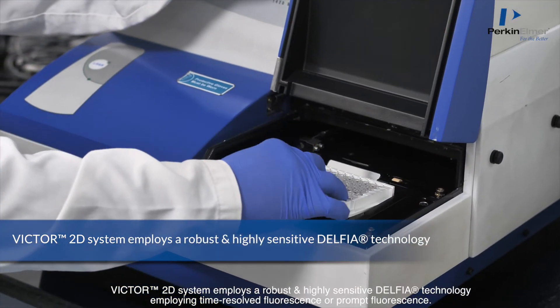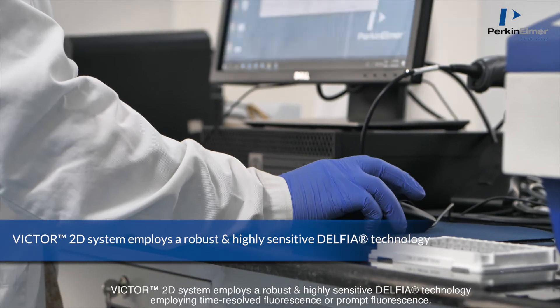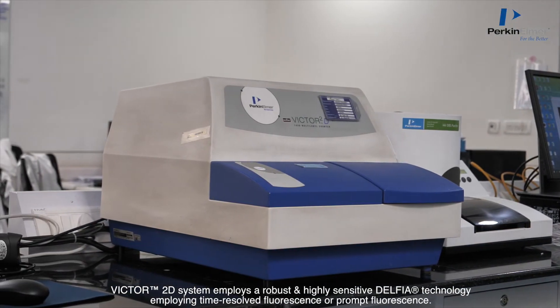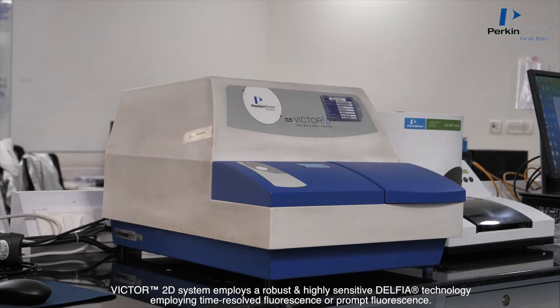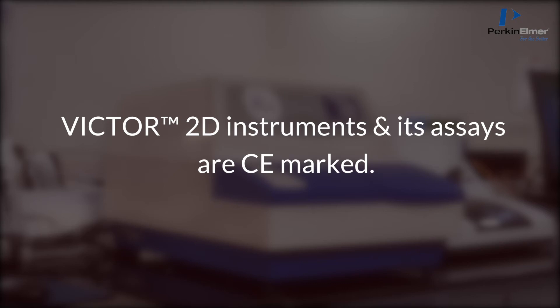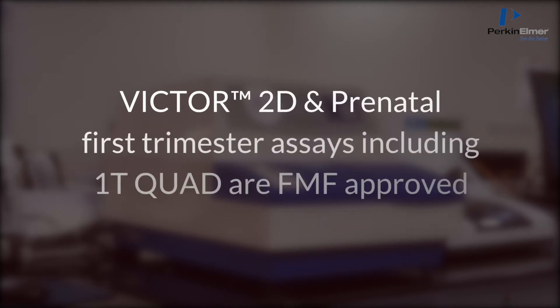The Victor 2D system employs a robust and highly sensitive Delphia technology using time-resolved fluorescence or prompt fluorescence. A unique feature of the Victor 2D system is the possibility to use the instrument for both prenatal and newborn screening. Victor 2D instruments and its assays are CE marked, and Victor 2D prenatal first trimester assays including the 1T quad are FMF approved.